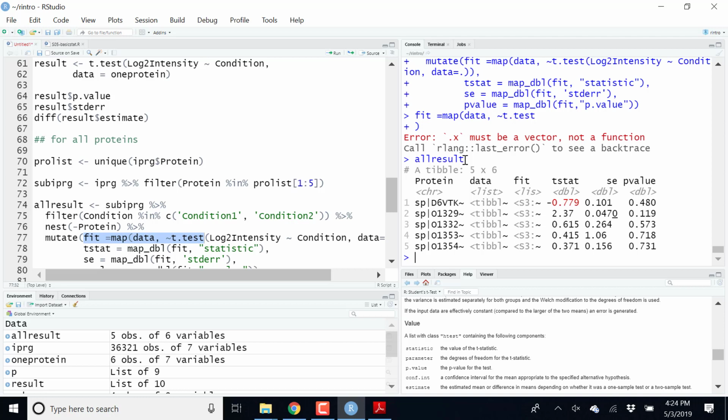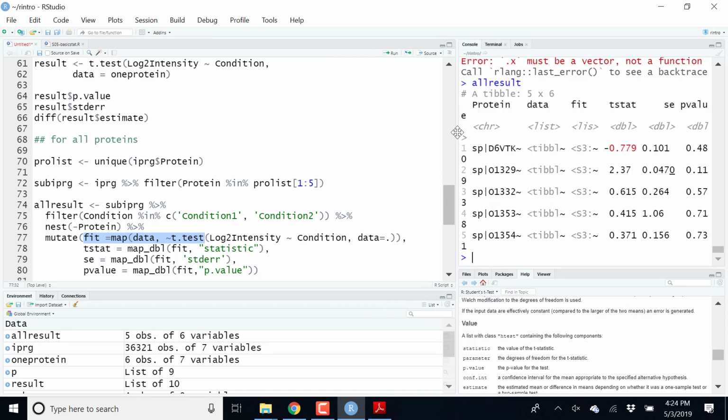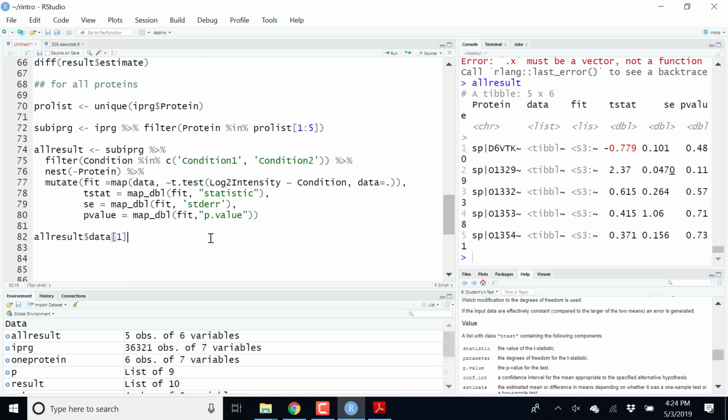So if you assign this one for all the proteins, you will get the 3,027 rows, one for every protein. Okay? So this is how we use the dplyr one.